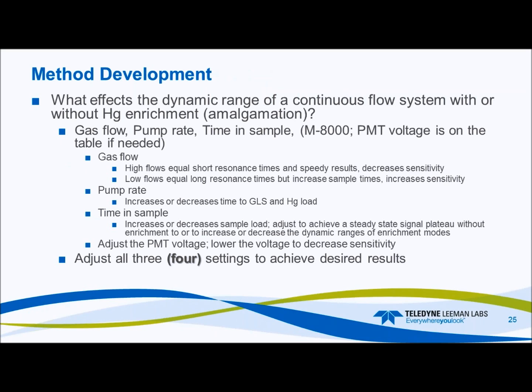So what affects continuous flow with or without HG enrichment or amalgamation? So you have your gas flow, your pump rate, your time in sample, and in our case, we have the ability to set the PMT voltage. So that's on the table if needed.